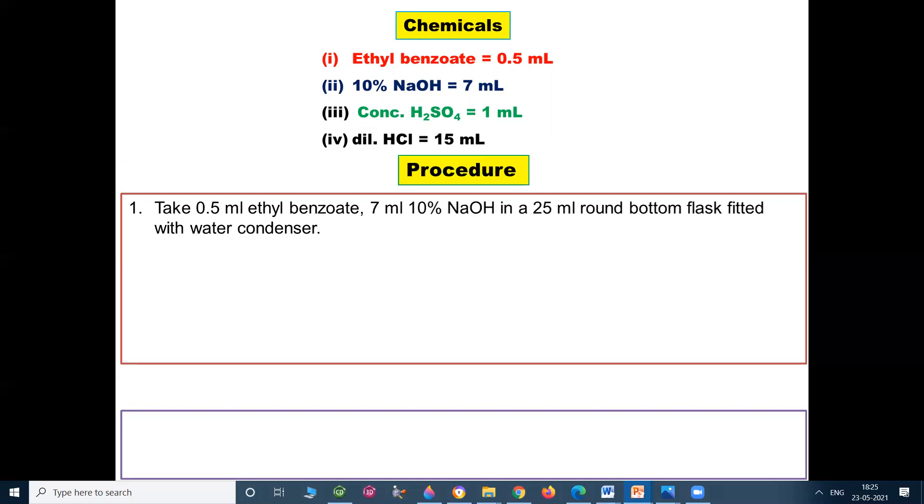Procedure of experiment. Take 0.5 ml ethyl benzoate and 7 ml 10% NaOH in a 25 ml round bottom flask fitted with water condenser. Boil the mixture for at least one hour. Disappearance of the ester layer confirms the completion of the reaction.